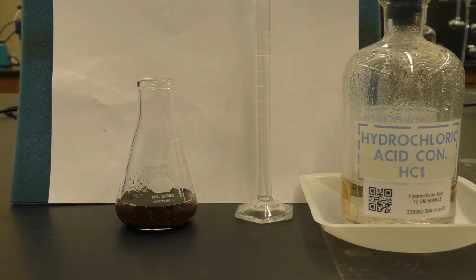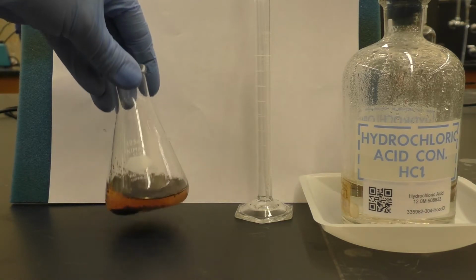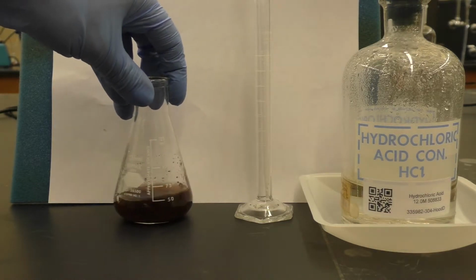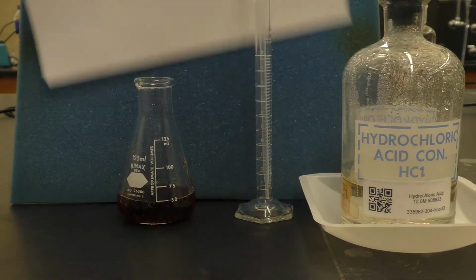You'll note the solution definitely is not soluble to begin with, although it is a little bit colored, but there's a lot of solid material here at the bottom and some floating along the top. We'll now measure out our concentrated hydrochloric acid.